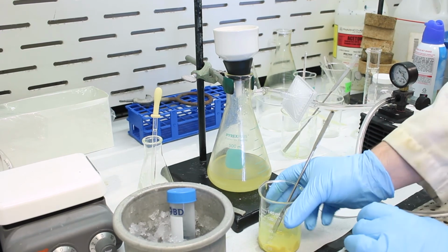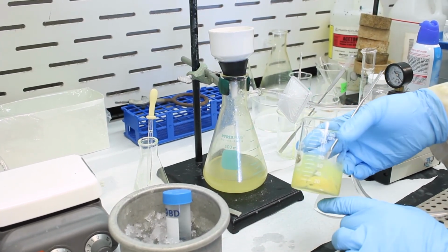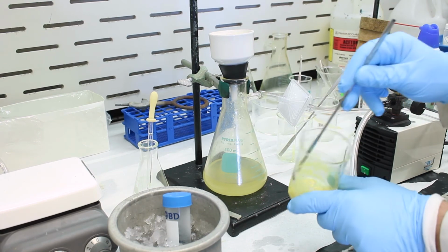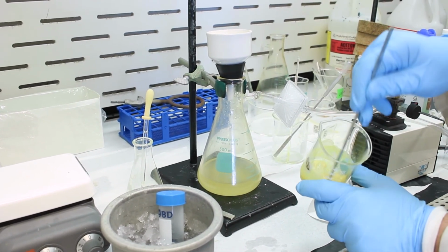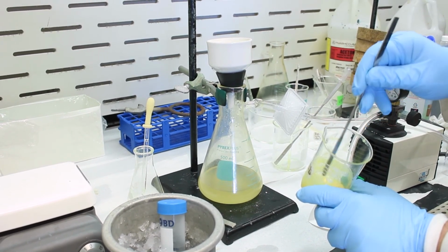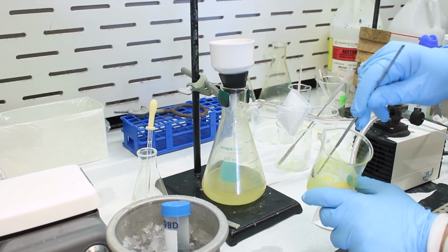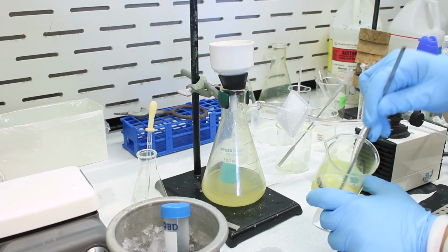All right, so our crystallization didn't work too well. We had to basically remove most of the ethanol, and then we added some toluene, and toluene seems to have sort of worked. So we heated the toluene, let it cool, and we have a solid. I don't know if you would call them crystals, so this is not ideal. Ideally, the crystals are nice long spears or needles, but this is more of an amorphous solid, so the purity here is not going to be as good, but it looks better than with the ethanol.